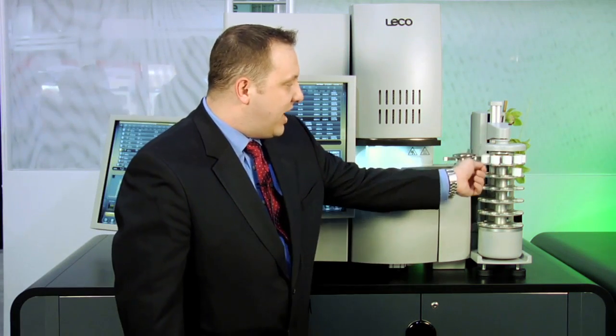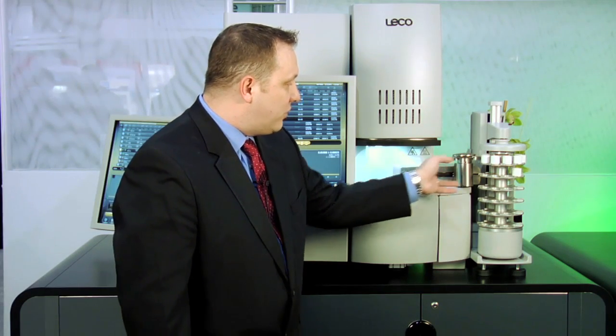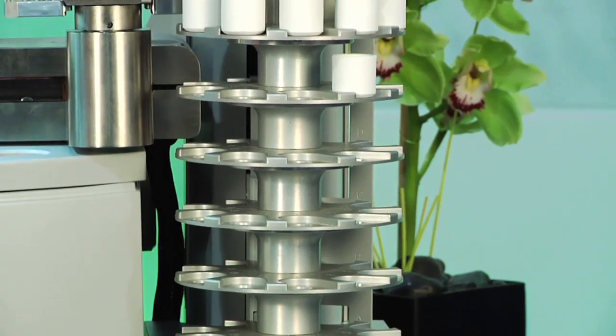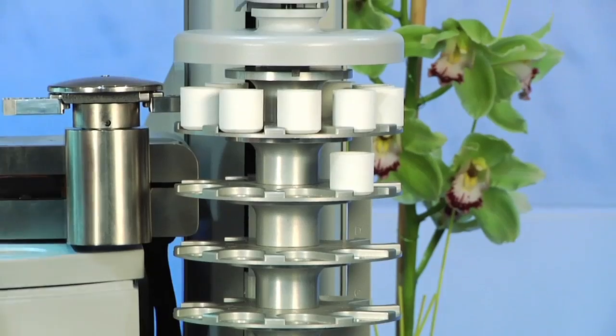Basically, it's up, down and rotations in a simple shuttle from the carousels to the pedestal and back with removal of the system.